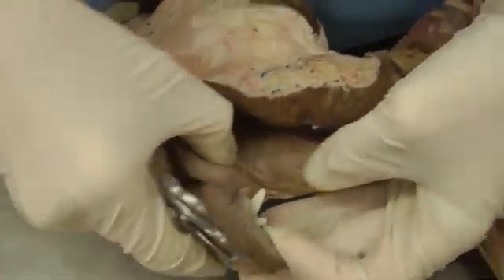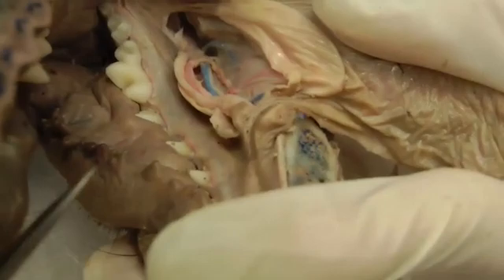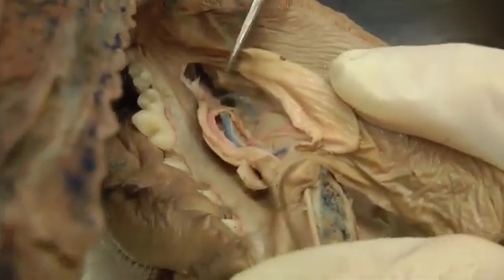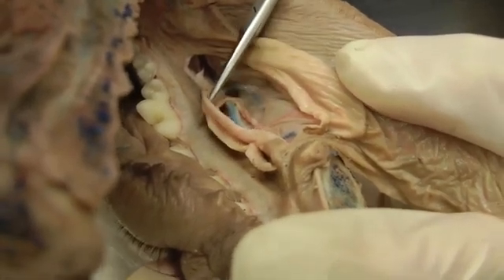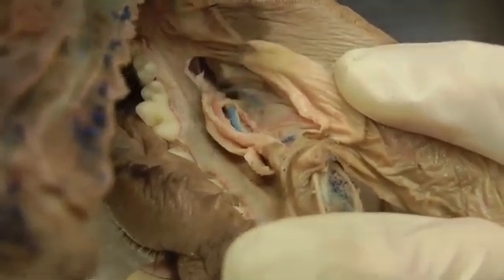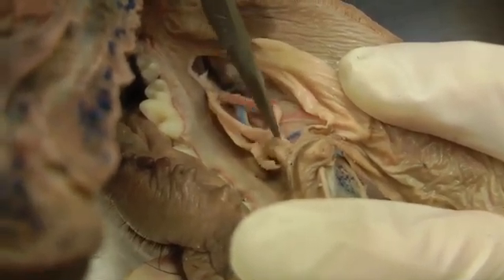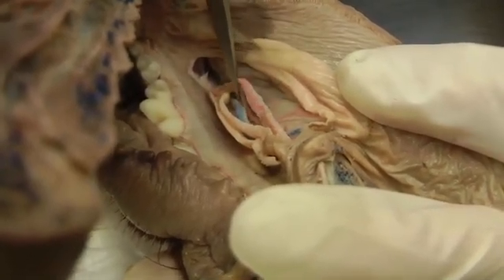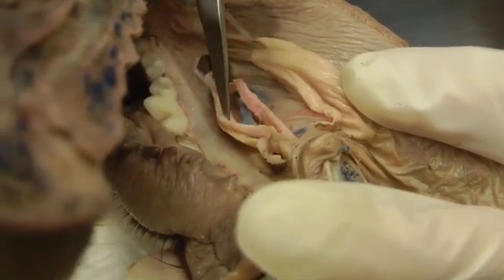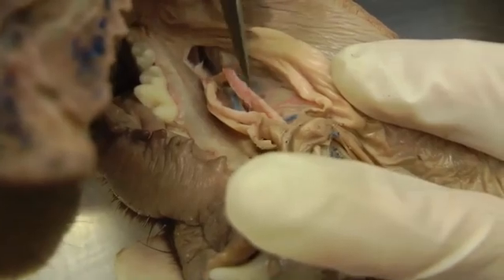The area has been cut open to look at the ducts underneath. Here is the sublingual caruncle, and the ducts coming in are the major sublingual duct and the mandibular salivary duct. They're a little hard to dissect apart from each other, but the one on the bottom is mandibular and the other is the major sublingual salivary duct. Incise the mucosa and look for those.